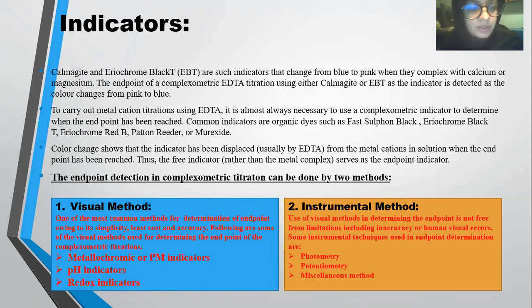To carry out the titration of metal cations, using EDTA is the most necessary.